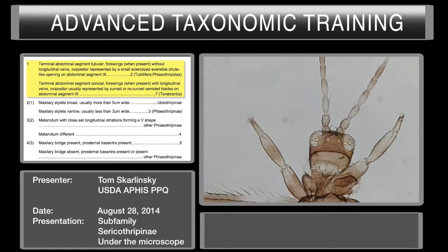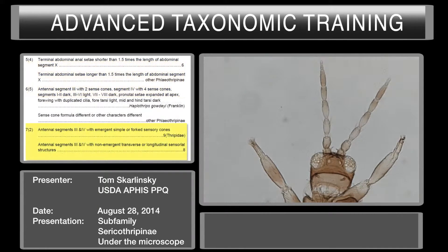So now what we want to do is shoot down to couplet seven. Let's take a look at our sense cones on antenna segment three. While we've got the antenna up here, we'll go ahead and get a count. We've got one, two, three, four, five, six, seven, eight.